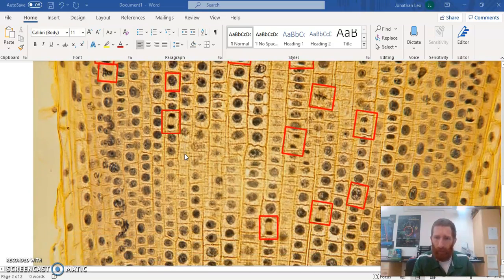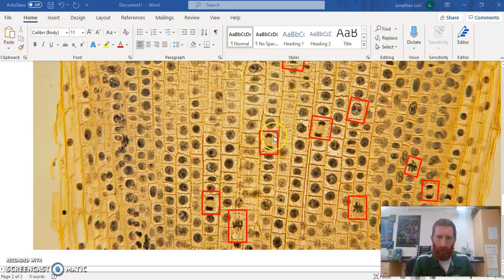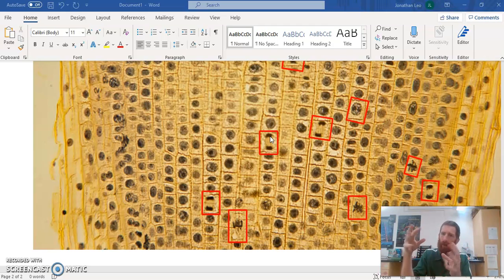And then telophase, we have a lot of telophase. Here we have a good telophase where the nuclear envelope is starting to reform, and we can see the DNA. We can't see any chromosomes, any stringy things anymore, but it's becoming one homogeneous blob again, right? Here's a good telophase right here. And then after telophase, what happens?